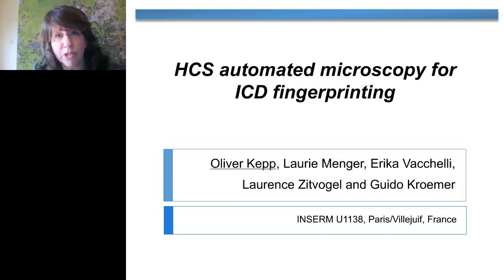For the second portion of the webinar, Jane Hesley, application scientist for Molecular Devices, LLC, will illustrate high-resolution and high magnification automated microscopy coupled with tailored image analysis for overcoming the challenges associated with segmenting cells of complex shapes such as neurons. Jane Hesley is an applications scientist for cellular imaging at Molecular Devices, LLC.